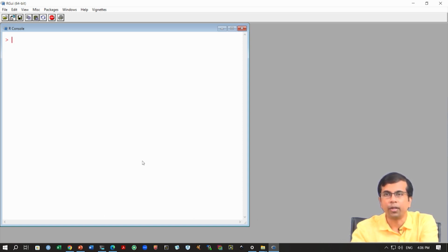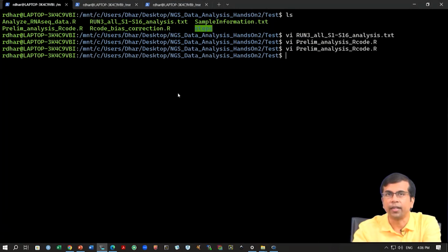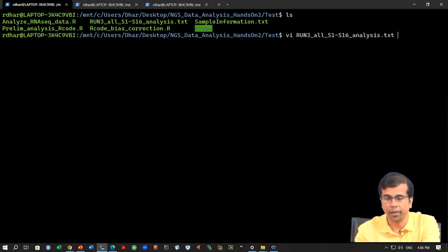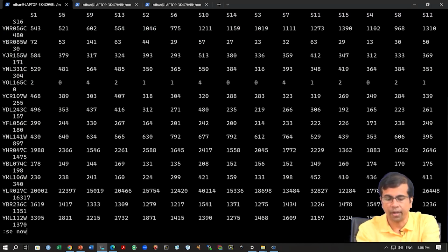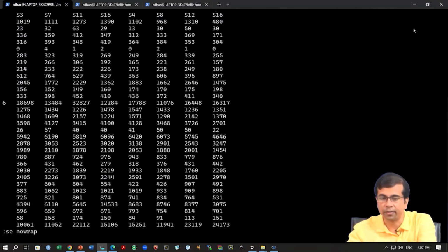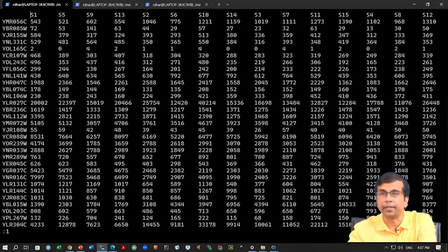So, that is the data we will work with before we actually do the DESeq2 analysis, etc. The count data is inside this test directory, and inside this we have this run 3 all S1 S16 analysis. Okay. Just very briefly I open it again, and you can see we have these samples S1 to S16. S16 you cannot see here, it is at the end. So, we have 16 samples and we have these 6,800 genes.